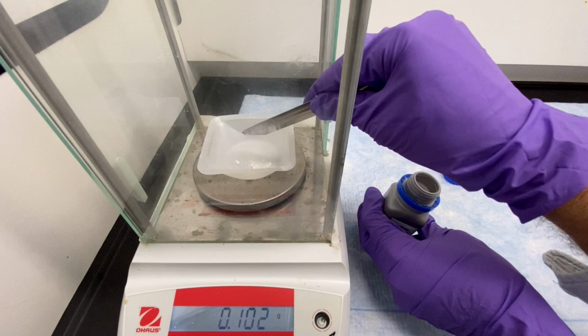A common mistake I'll see when students measure out solids is they'll take a huge scoop on their spatula, and they'll go into the balance and they'll just dump it all into the balance all at once. And oftentimes that'll give them a mass that's much higher than what they want. So to control how much solid you add to the weighing boat, what you really want to do is take a scoop of solid onto your spatula, bring it over the weighing boat, and instead of flipping it over, shake it just a little bit until some of the solid falls off of the spatula into the weighing boat. And that gives you much more control of how much mass you're adding.